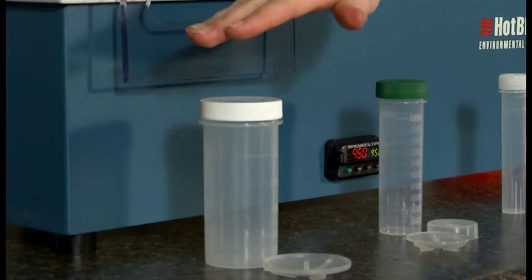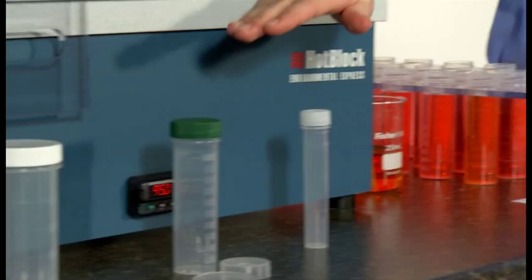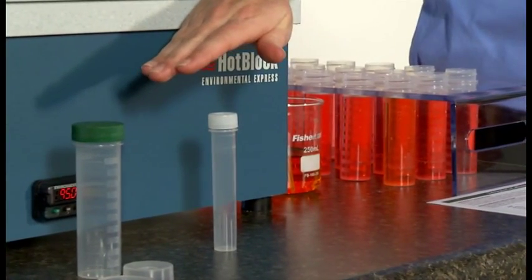Our digestion cups and accompanying watch glasses are specifically designed for a corresponding block well size depending on your sample volume.